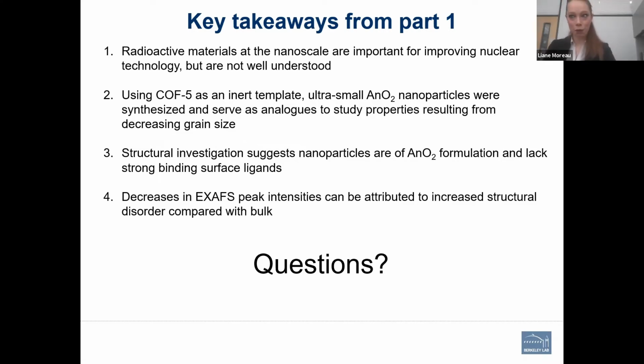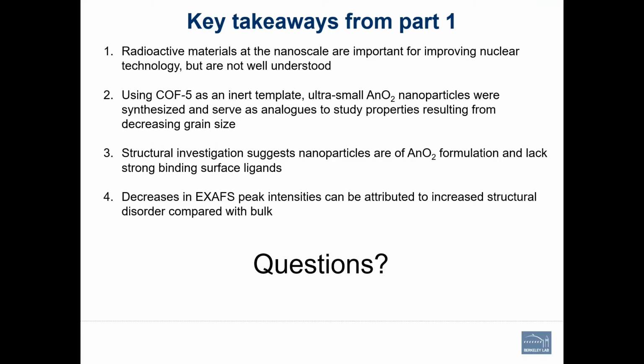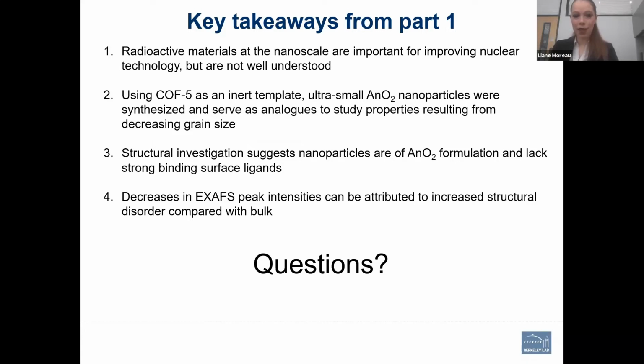Sure, so I'll get into this a little bit moving forward in some other simulations that we've done in comparison to clusters, which are in fact crystalline, however relaxed and not kind of in rows. I think one challenge within these systems is that if we get good enough microscope images, and I didn't show them here, we can see lattice fringes. So that generally would suggest that your structure is crystalline. However, with electron microscopy, the high local heating you get under the electron beam can sometimes induce increased crystallinity that you don't otherwise see. So my interpretation is that in fact, the atomic positions are relaxed. So I do view these as being more amorphous-like. I know that my synthetic collaborator would probably not like the fact that I'm saying that because he likes to think of them as crystalline, just not having atoms exactly in rows, if you will. To me, that also kind of defines amorphous. So I would interpret that they are amorphous-like.